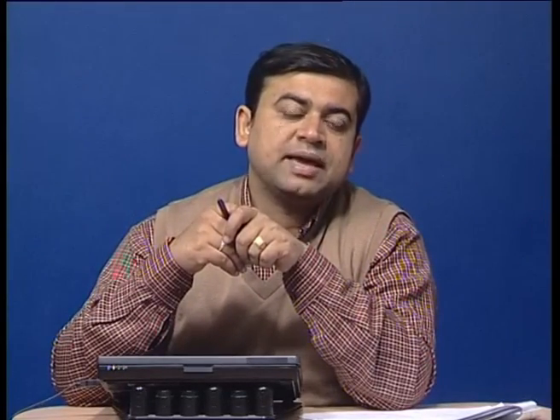So you have a growth in fluorescence, and then a comparison between the reference and the signal, and that way you can evaluate close to 60 to 70 samples, maybe even about 80 samples, making a few of them references for a proper signal analysis module.